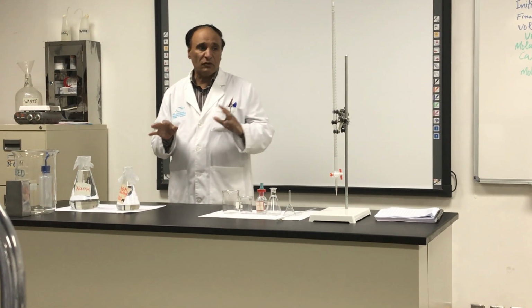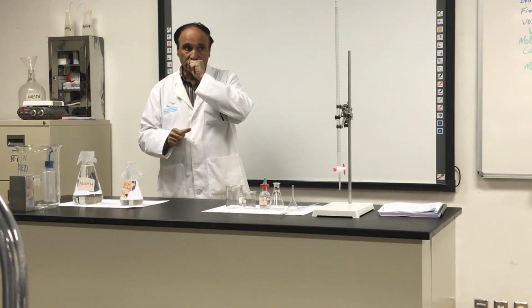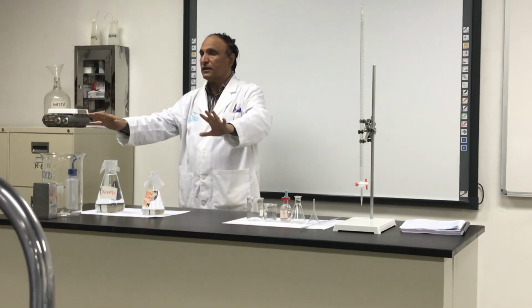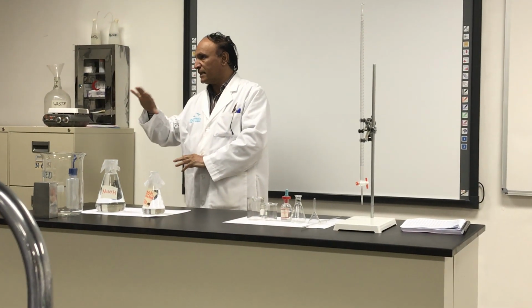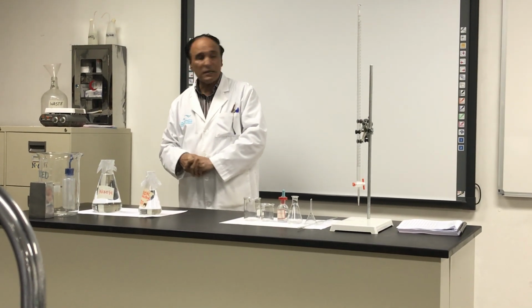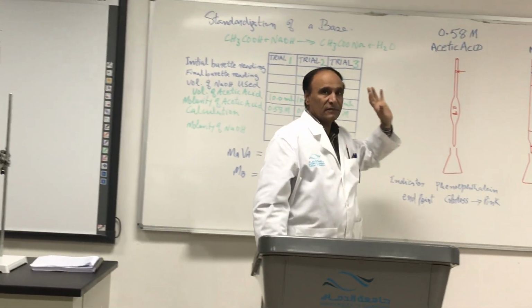The experiment which I am going to do with you is a very common experiment in chemistry. All over the world, chemistry students do this experiment. That's why this experiment has been selected for you. This experiment's name is standardization of a base.